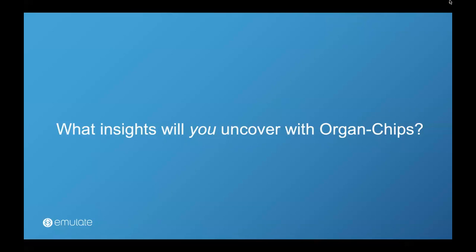So that's the end of my presentation today, and I think what I would do is close up with a challenge to the in vitro cell biology research industry. What insights will you uncover with organ chip technology? Now, I've shown you examples of how the technology can be used to extend functionality, open up new mechanisms, and become a more predictable system for predicting human responses.